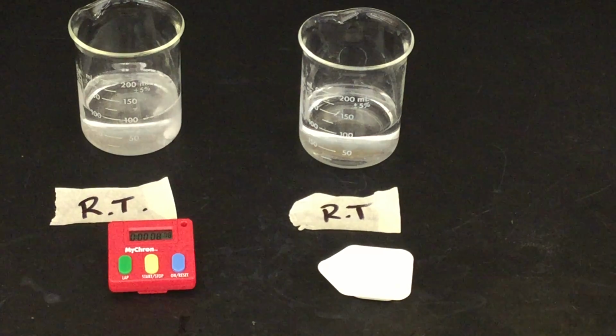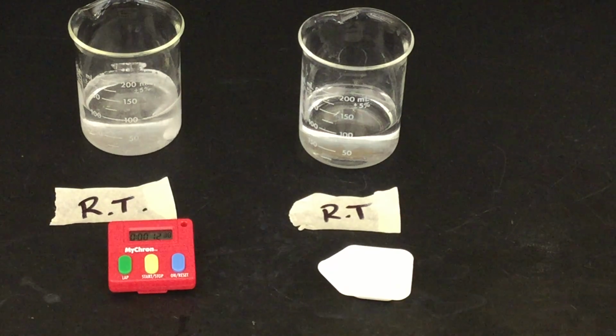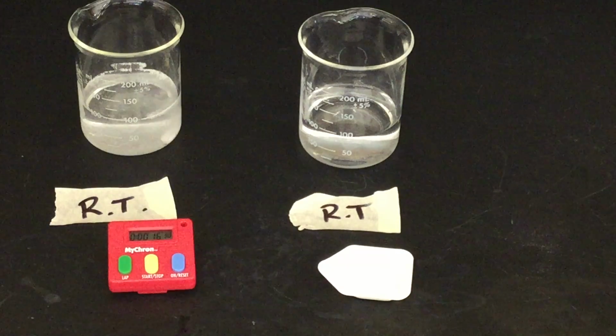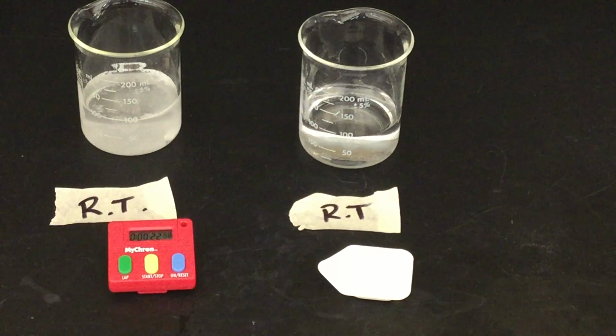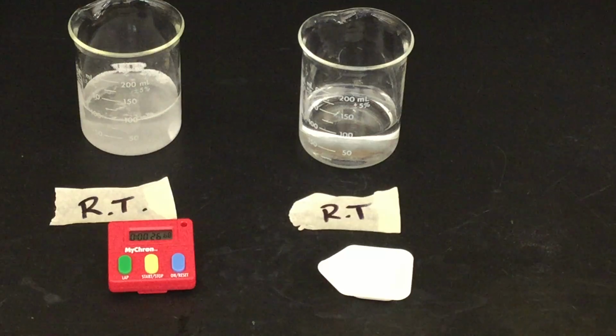The hot was 18 seconds. The cold was 1 minute and 44 seconds. So it should be somewhere in between those two readings.